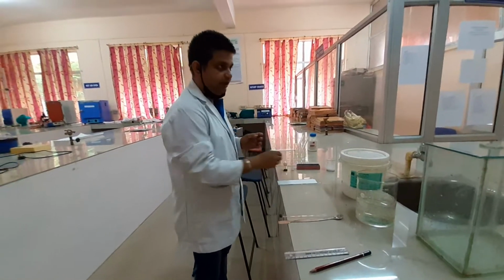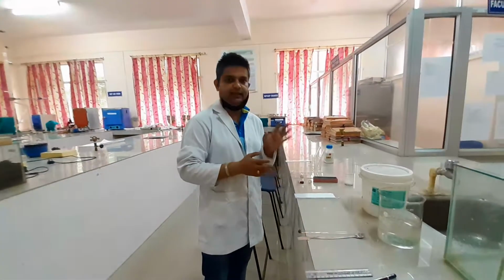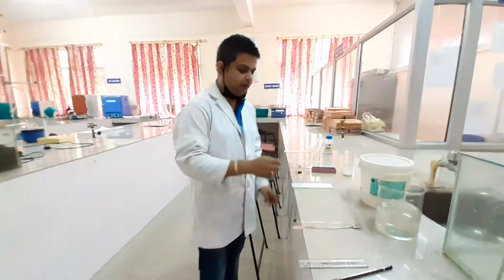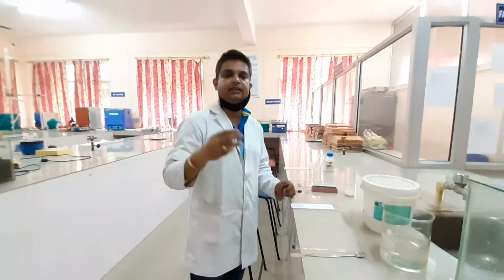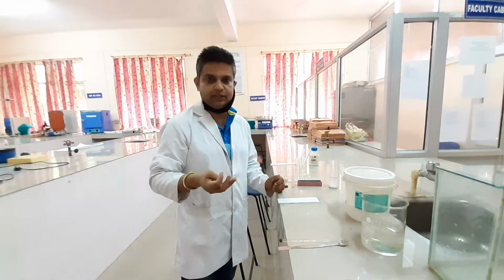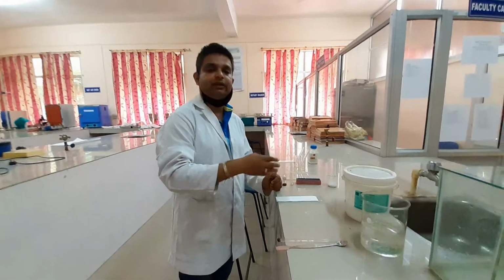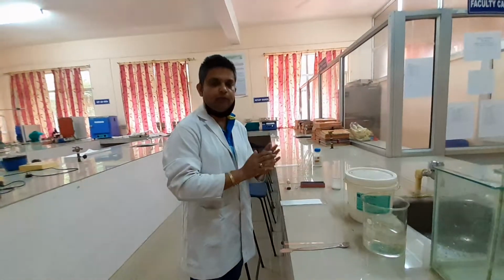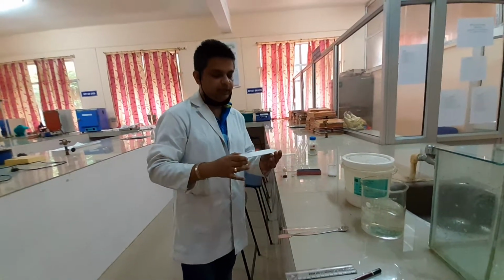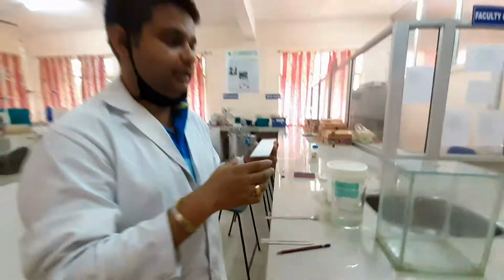What we have applied here is a standard amino acid. As the standard amino acid we have taken the valine solution, whereas the mixture of amino acid consists of three different amino acids. We have taken arginine, valine and cysteine. So three different amino acids we have taken, and now we are going to compare. Our plate has been dried. Now we are going to place it inside the solvent system.